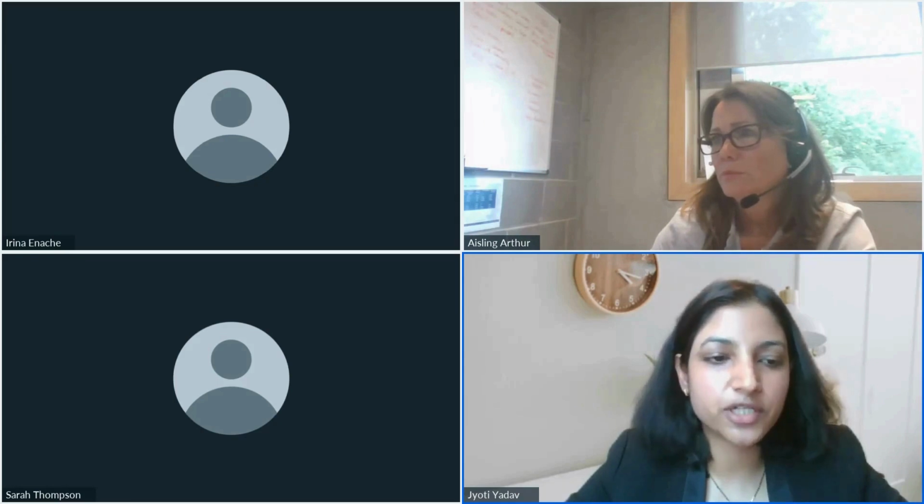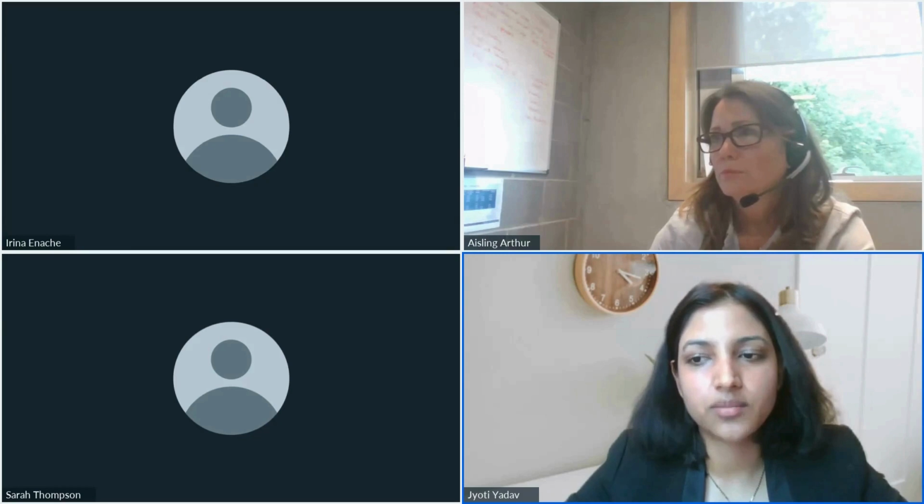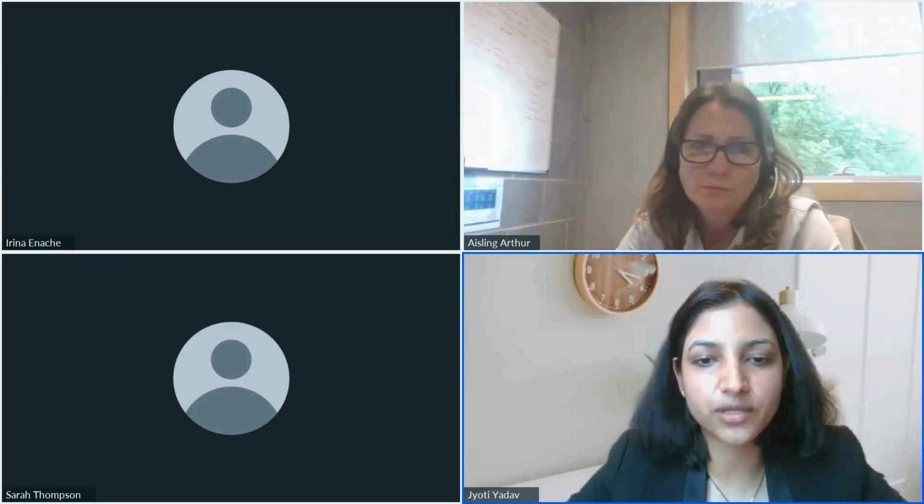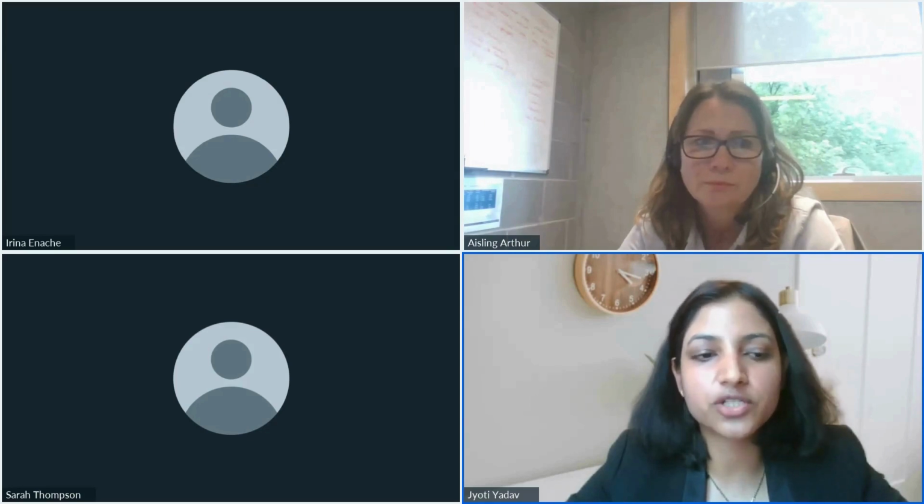So it's difficult to compare. But we are working in the future to standardize the particle size distribution, especially compared with the Mastersizer. We can do that in future, but for now, because these are different technologies, it's difficult to compare the particle size distribution.